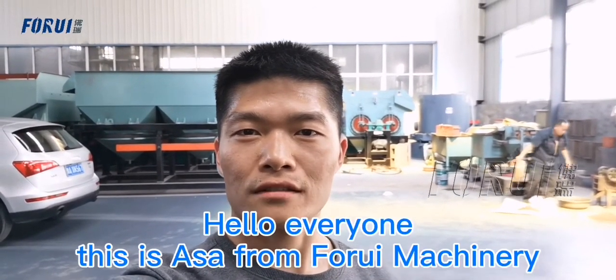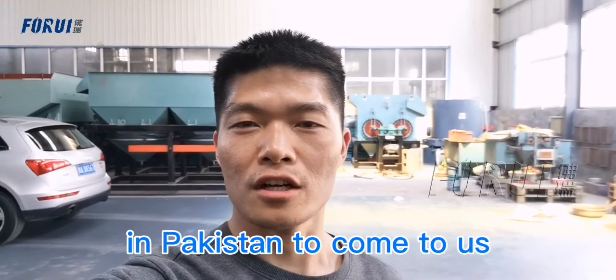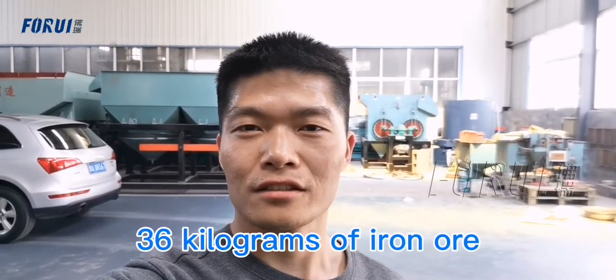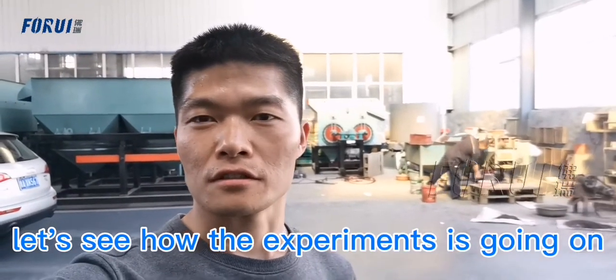Hello everyone, this is Asa from Forui Machinery. Due to the Covid-19, it's not convenient for our customers in Pakistan to come to us. So they sent us 36 kg of iron ore. We will conduct experiments and feedback to them. Let's see how the experiment is going on.